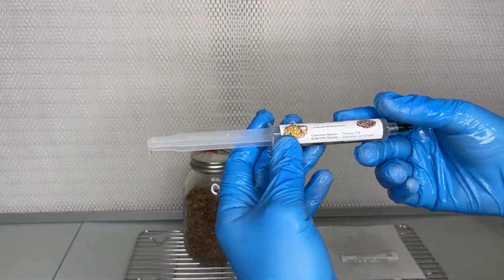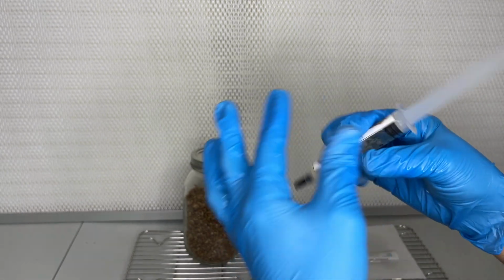The first step is to inoculate some sterilized rye grain with turkeytail liquid culture.